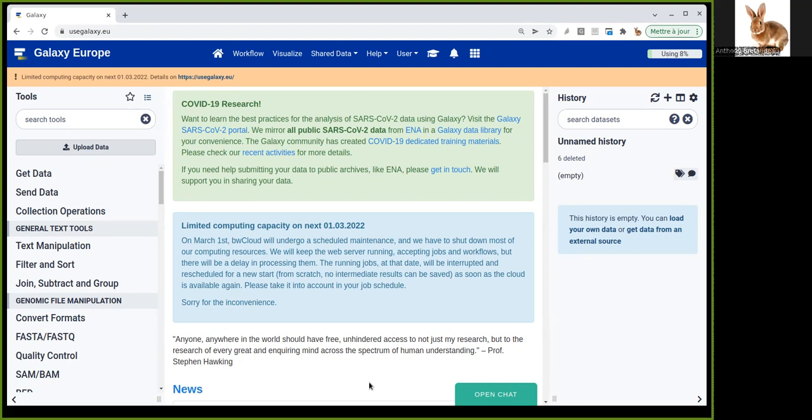You can also get interspersed repeats, which are small sequences found in multiple places in the genome. These can be SINEs (short interspersed nuclear elements) or LINEs (long interspersed nuclear elements).